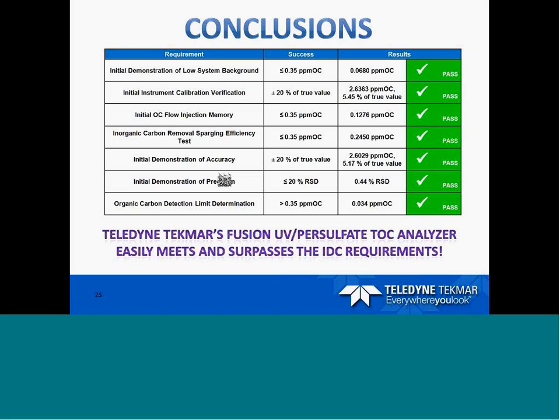And that has to be within plus or minus 50% of the true value. Now, you also will run a medium calibration check, and after 10 samples, for the 10th sample, you need to run a continuing calibration check as well. That needs to be plus or minus 20%.